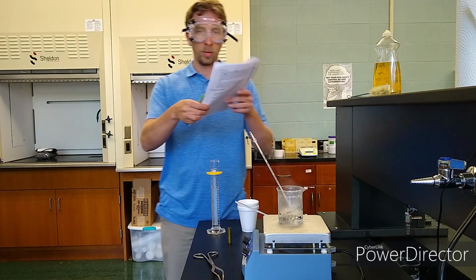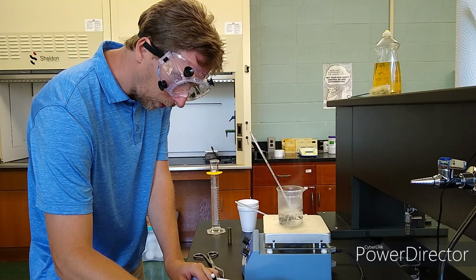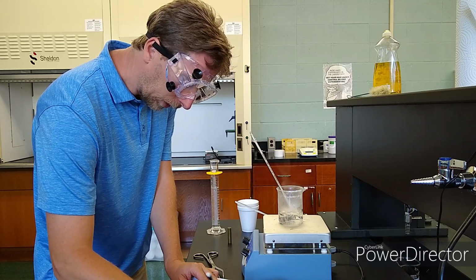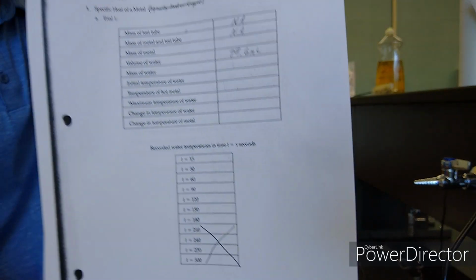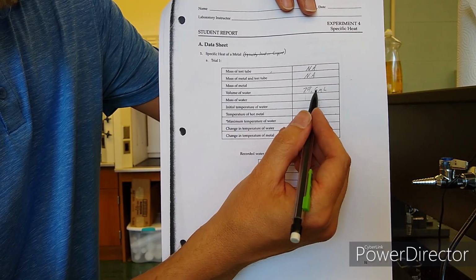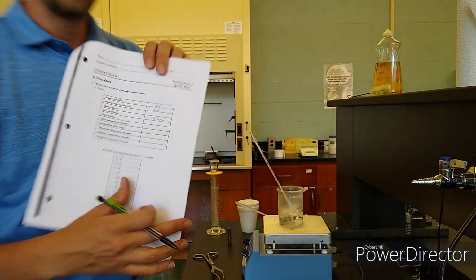Okay, so let me show you where to write this down. Let me write it down here. Volume of water is 79.6 milliliters. See that? That's the volume of water, 79.6 milliliters. Now what's right below that? Mass of water. Mass of water.